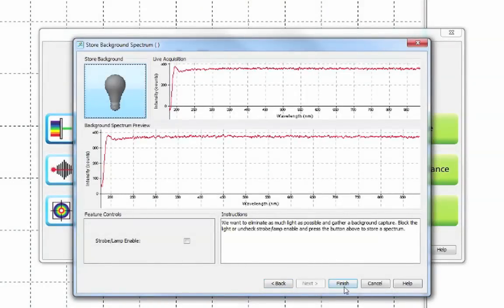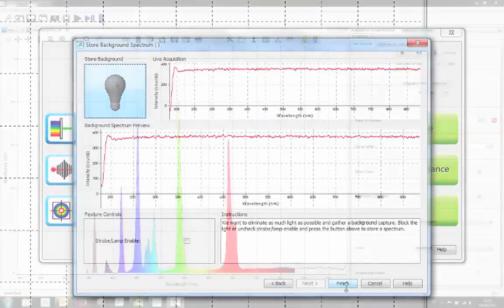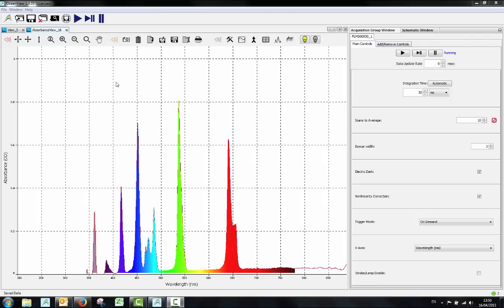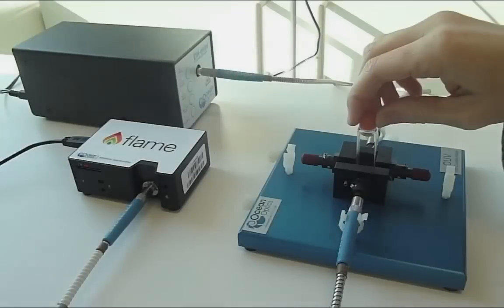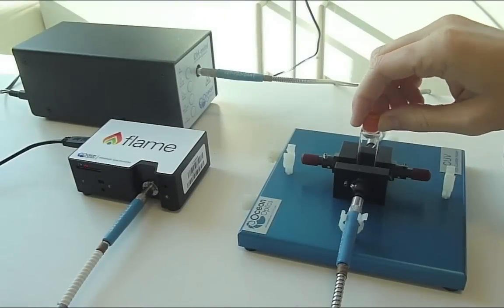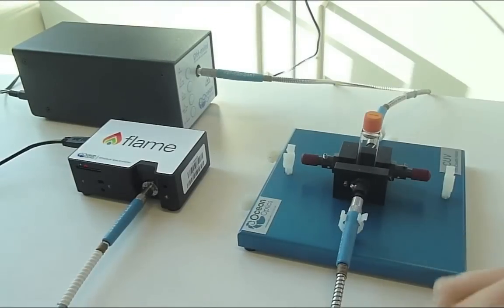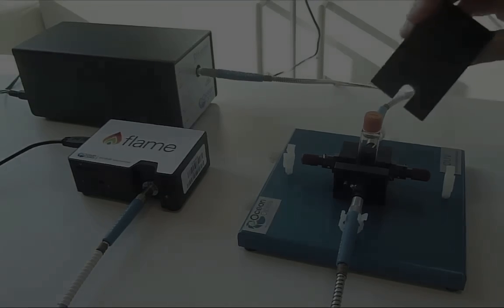Now press finish to close the wizard. With your light source on, your referenced absorbance measurement can now be seen in the absorbance view tab in Ocean View. Place your sample back in the cuvette holder to take a look at its absorbance spectrum.